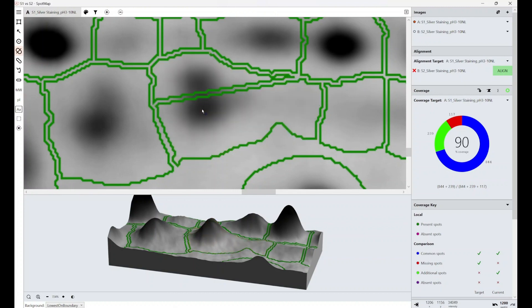If I left click again, you can see that the spot is now turned into two spots and can be measured and will count towards your coverage score, and you can proceed with your analysis from there.